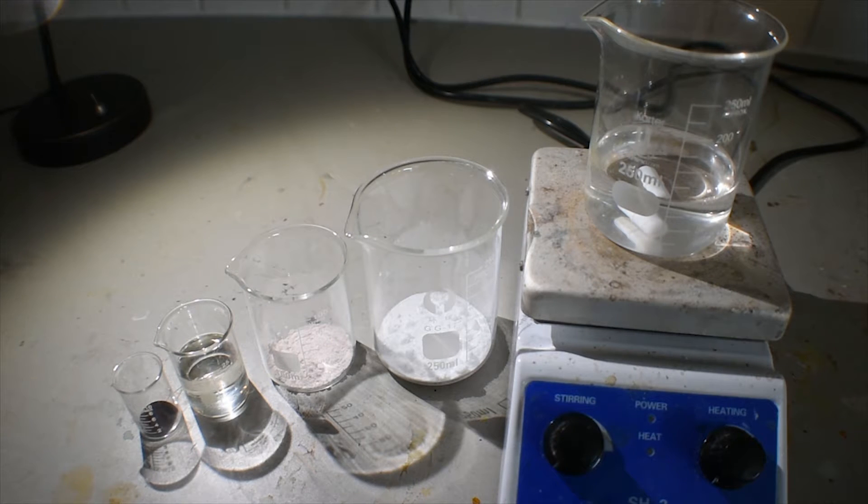Hello everyone, welcome back to another video. Today I'm going to be showing you a complex of manganese-3 and acetyl acetone.